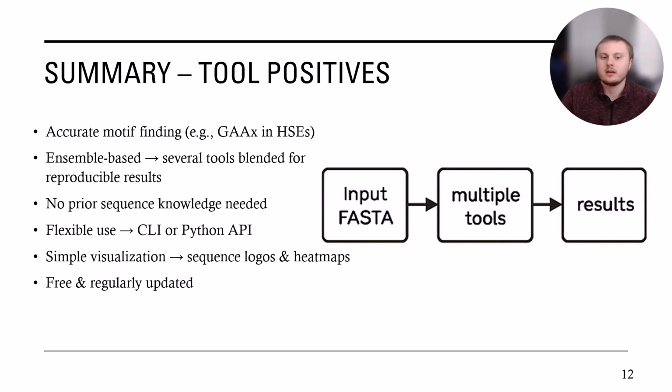So moving on, the install process is pretty adaptable. There are many ways to do it, but for the ones that we know of, there's a command line interface way, which is just in the command line or terminal or Anaconda, and you can also install it through the Python API. This makes it more versatile in the amount of projects it can be used for.